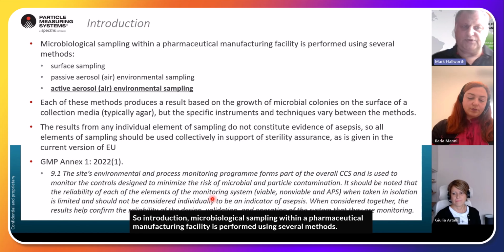Well, it could be that somebody opened a door, in which case it can be translatable to a function within the clean room, and therefore does that put product at risk? It's a high likelihood of that. If I get CFU activity and 5 micron activity, then those 5 microns are indicative of free-floating microbial activity in a clean room, and therefore there's a high probability that I've got free-floating microbes within my system.